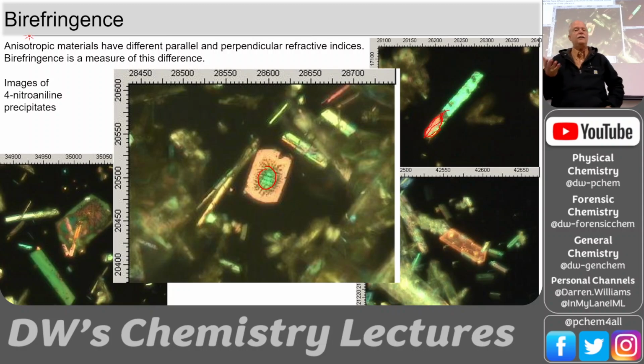It's the same thing that happens in a grating, but this is a volume grating. So we're getting diffraction of light based on the thickness of the grating, not on the dispersion with the lines. So in instrumental, you had gratings, and it was angle dependent based upon the lines that it hit. You can take those lines and turn them sideways, and you have a volume grating. It's the spiral staircase going through the grating, and depending on the thickness of the grating, you get the different colors.